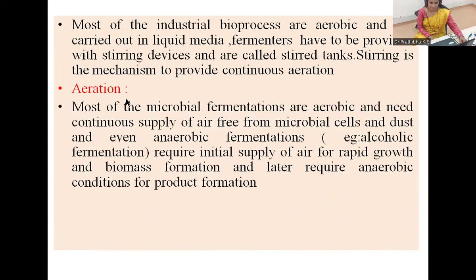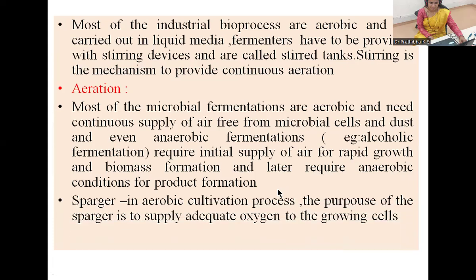So aeration means sending air inside the fermenter vessel by using the sparger. Most microbial fermentations are aerobic and need a continuous supply of air, which must be totally free from microbial cells, dust, and any other contaminants. Even anaerobic fermentations like alcoholic fermentation need a supply of air in the beginning for rapid growth and biomass formation, and later switch to anaerobic conditions for product formation.